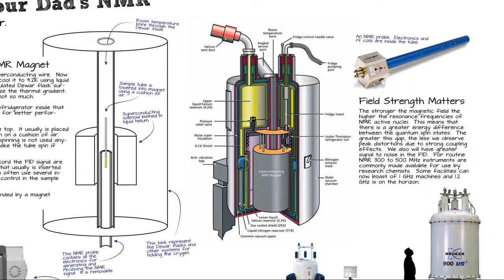Outside of the liquid helium is a bath of liquid nitrogen, because the lower the temperature difference, the better your insulation is going to behave. So you'd rather your liquid nitrogen boiling off than your liquid helium. Of course, your liquid helium is boiling off as well. You'll have to replace your liquid helium every so often. You've got to replace your liquid nitrogen once a week. So basically, we have a sophisticated Dewar flask with our magnet in there. And lots of electronics, and that's why these NMR cost so much. Speaking of electronics, there's our probe. We would put that up the tube, up the center. Your sample's going to come down from above and go into this part of the probe here. And here's where all the electronics are, and this is where all the control is, and this would be connected actually to more sophisticated electronics controller boxes that are just outside your instrument.